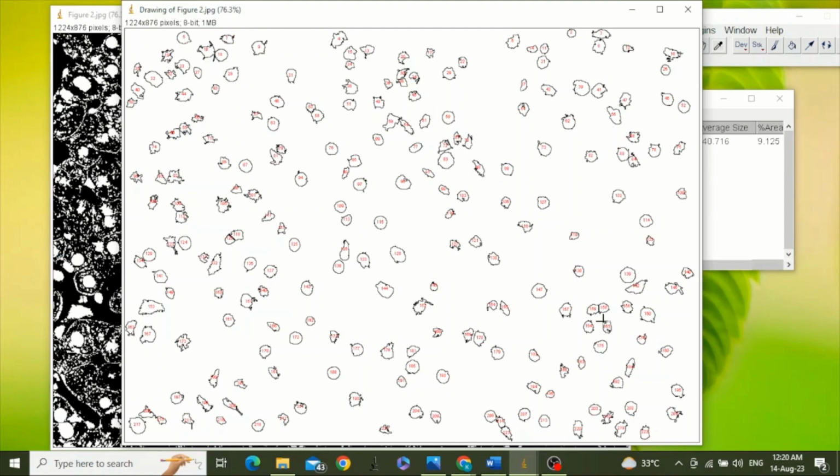Okay, I hope that you have understood how the number of cells are counted in a histological image. If you have any questions regarding this, please let me know.